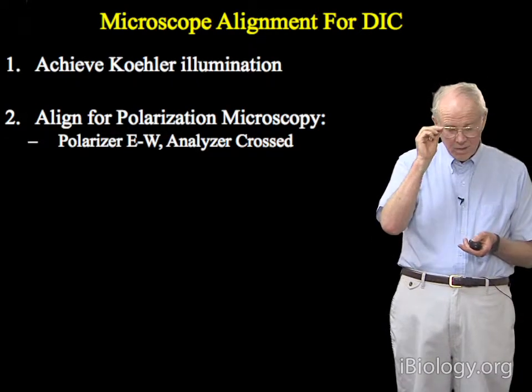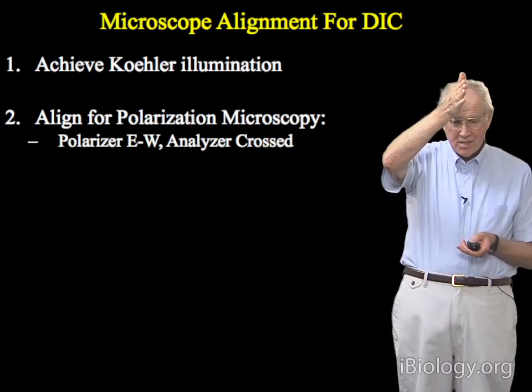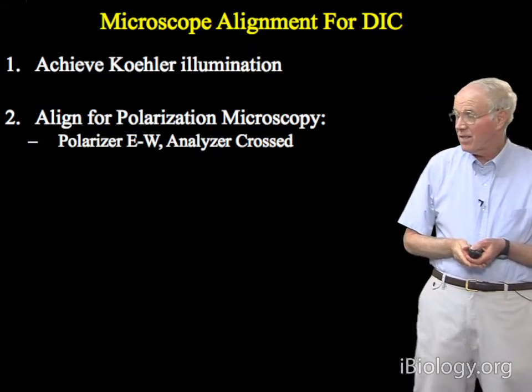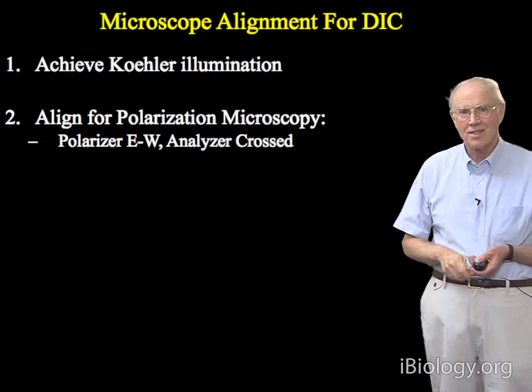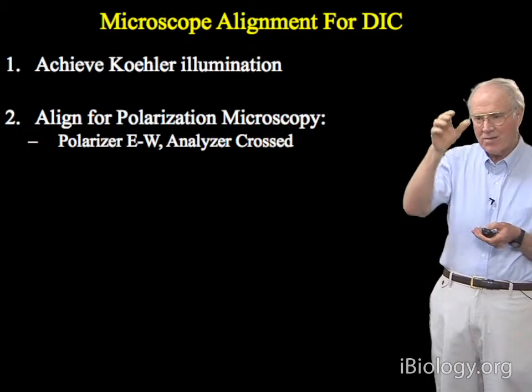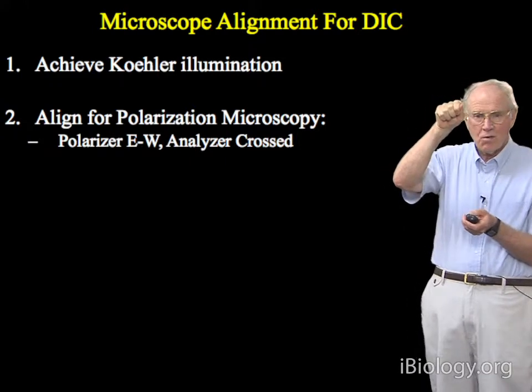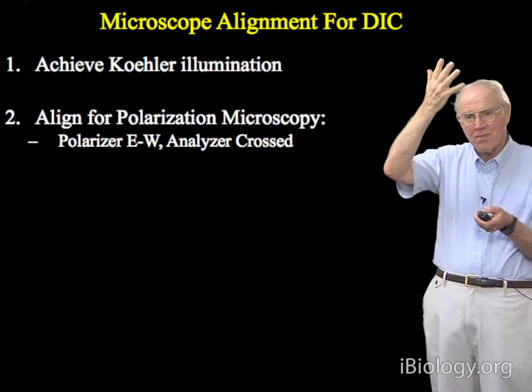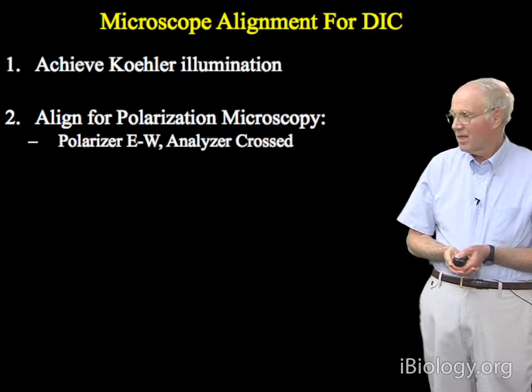But what you want to do is look down the microscope and rotate the analyzer if you can, and make sure that it makes a maximally dark image. That's called extinction. Usually the manufacturers, particularly today, are really good about this, and they've already pre-aligned all these things, and you slip them in there and you'll get it. But jiggle the analyzer a little bit, rotate the polarizer a little bit, and make sure the two of them are crossed. Because if they're uncrossed at all, that represents noise coming through the system and prevents you from seeing the weakest intensity specimen detail.